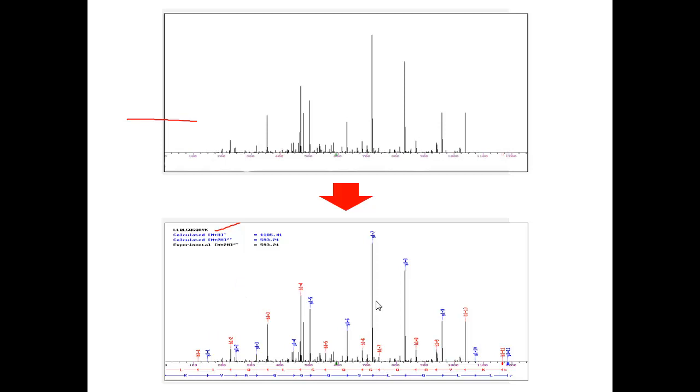Now, because it's so conceptually appealing, you'll think that the plan is to measure the distance between two peaks, record the mass that it would be, and interpret in this case that it would be a leucine amino acid that is responsible for that, and that would be the way that we would interpret this molecularly. In principle, this is a very valid way to go, but in practice, it's too complicated still. The algorithms, while getting better, do not work well enough that way, and so I want to guard you against thinking that.